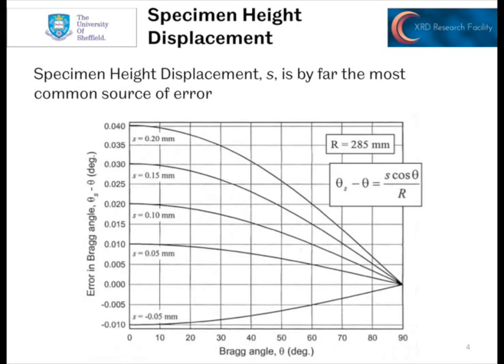The shift in peak position that results from specimen height displacement is given by the equation shown here. What you can see in the graph is effectively five different shifts in peak positions according to different specimen height displacements — only very small offsets, fractions of millimetres, yet we see an observable effect. These would all be shifts of one or two data points to higher or lower positions across the diffraction pattern, which can make your analysis of your X-ray data an awful lot harder. It's always within your control to avoid, so it's really important to try and avoid it — put the sample in the right place.